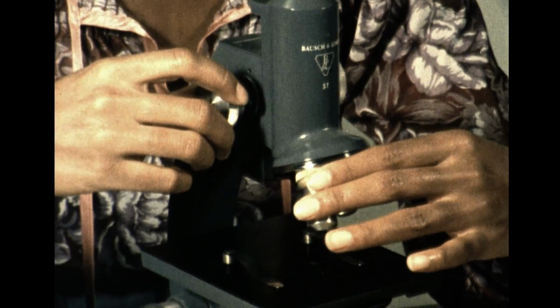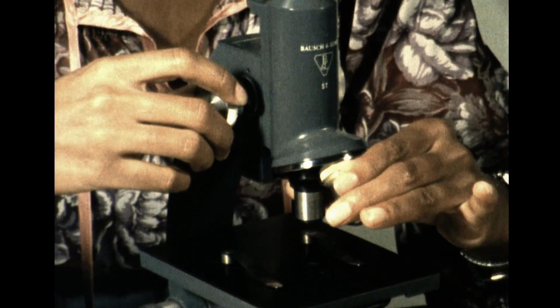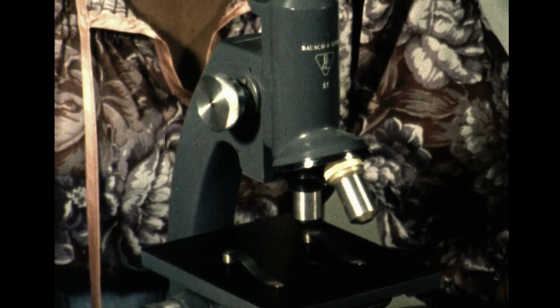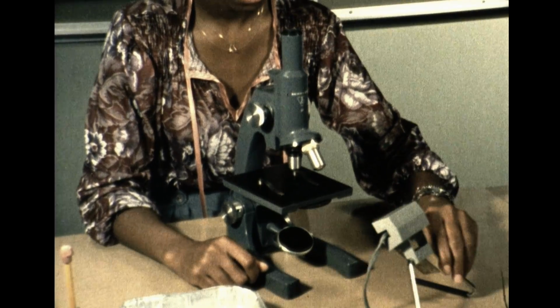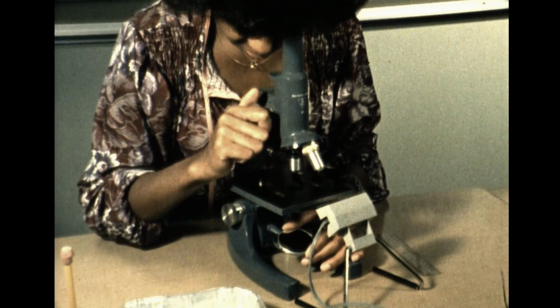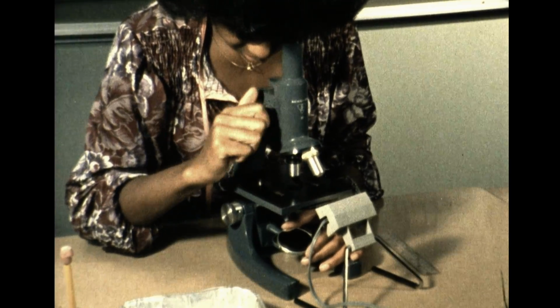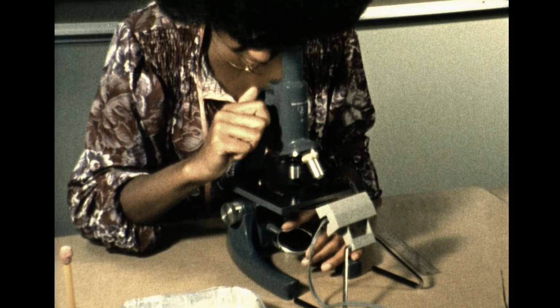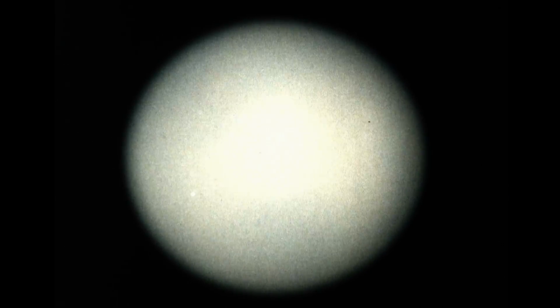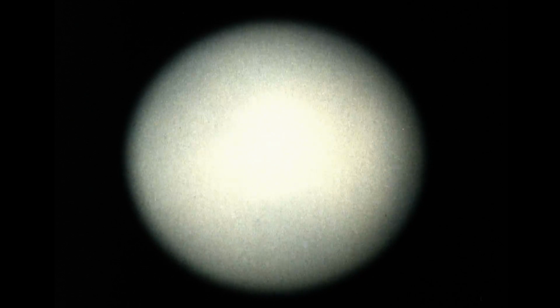5. Rotate the turret and put the low power objective into place. There will be a click when it reaches position. 6. Move the light source into position and adjust the mirror to direct the light beam through the window. Check by looking through the microscope. The illuminated disc is called the field.